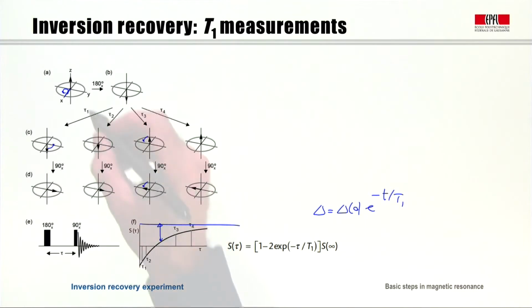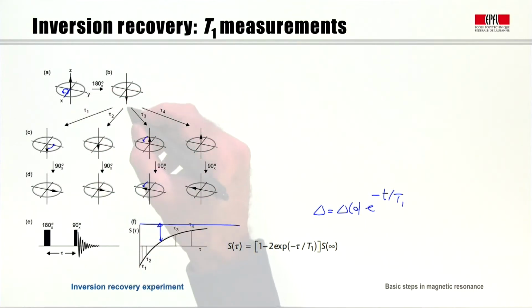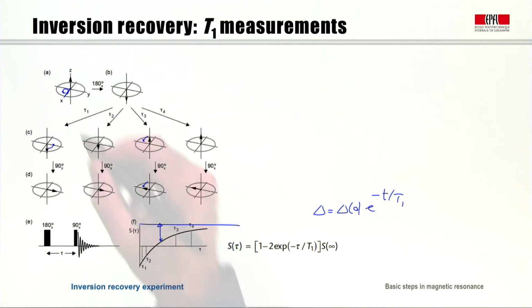Mind you, this experiment also works if the initial inversion is not perfect. It could be that the negative component is a bit shorter than the positive component, and therefore we would perhaps not start at -1, but we would have a slightly different decay, but we can still measure the deviation accurately. The only point is that we have to introduce a variable fudge parameter here in such cases, which are quite commonly encountered.